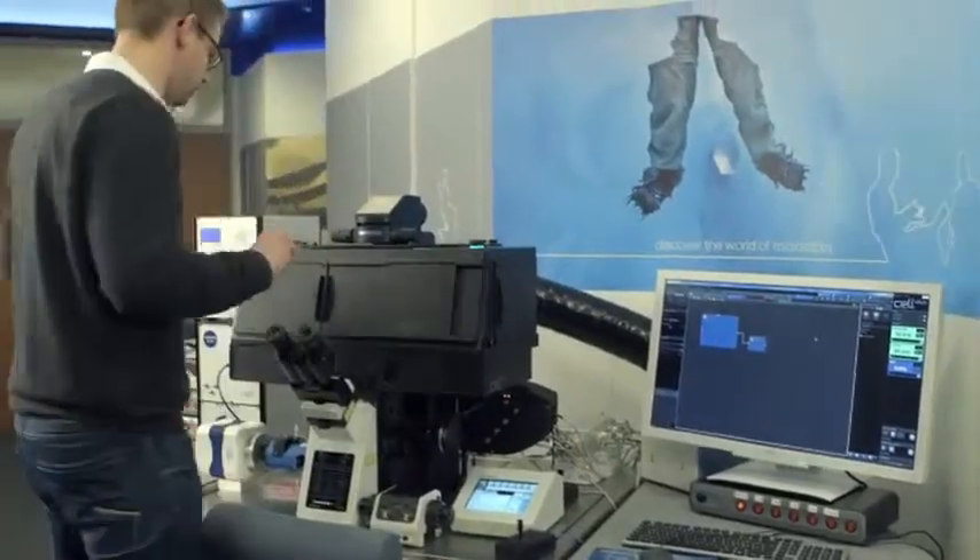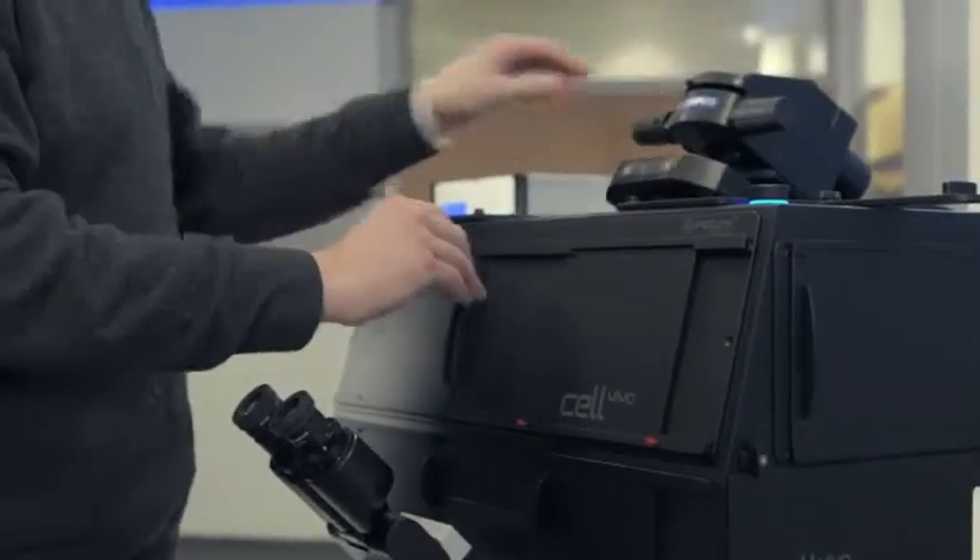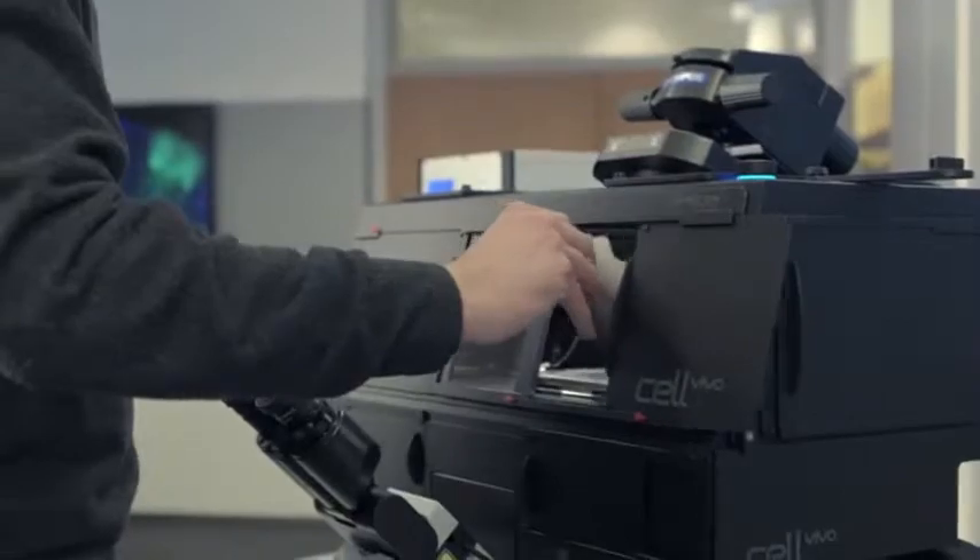Workflow ergonomics is prioritized, with effortless single-handed operation, meaning that you no longer need to place samples on non-sterile surfaces.